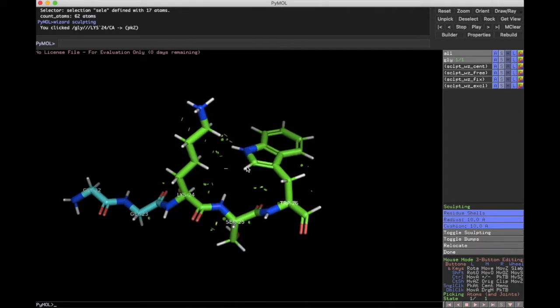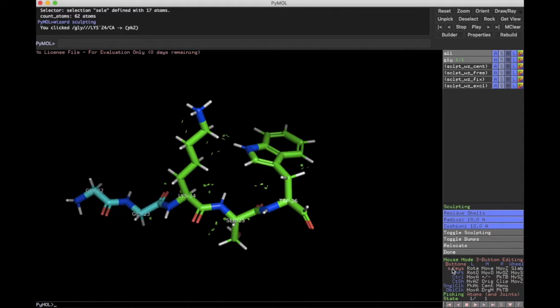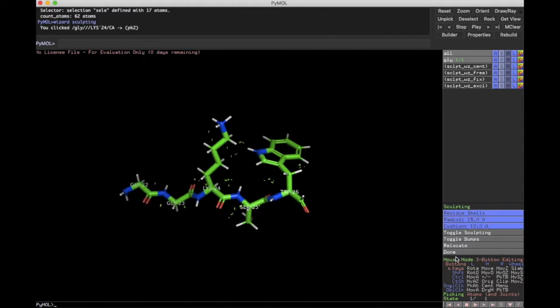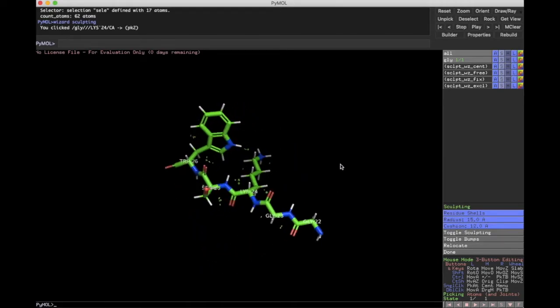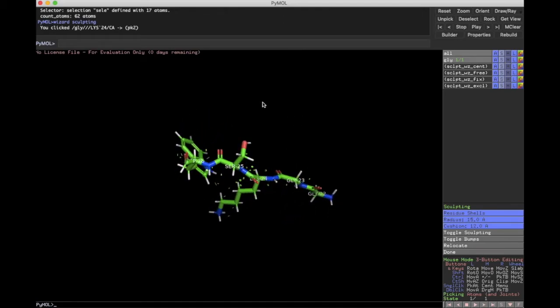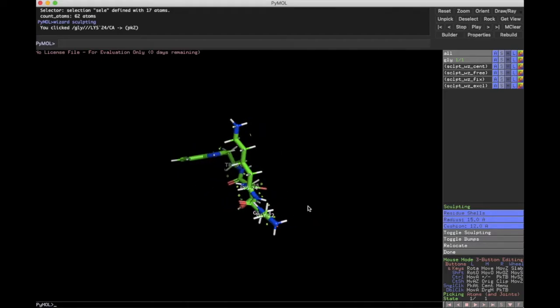So there was definite clashing happening here, and so they separated quite a lot. Still separating a little bit more. The tryptophan side chain is rotating out a little bit. Let's include the whole thing here. So you can see the backbone is shifting a little bit. All right, so it's quite a different shape than it was before. These spread apart. The backbone twisted a little bit here.